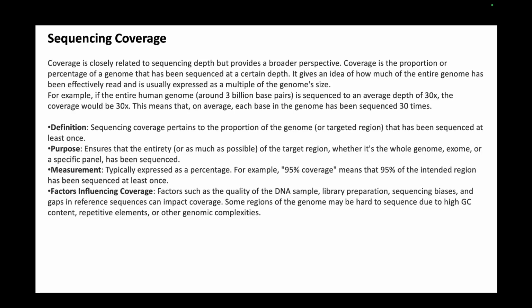It is possible that you have sequenced the whole genome in the sample you collected, but the next issue that can arise is that the genome of your reference is not well established. There are parts of the genome missing in your reference file, certain gaps in your reference file.